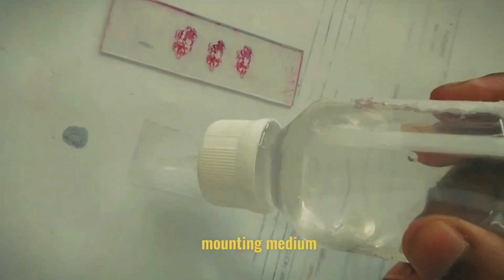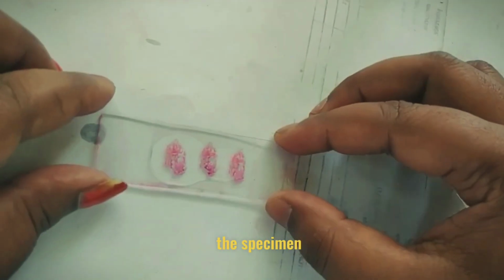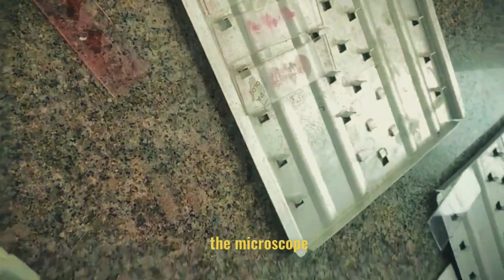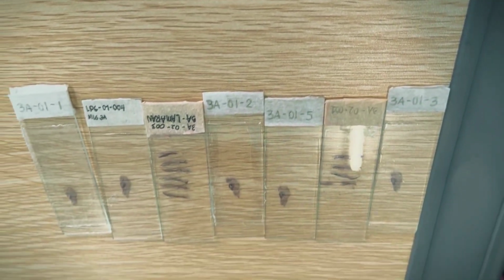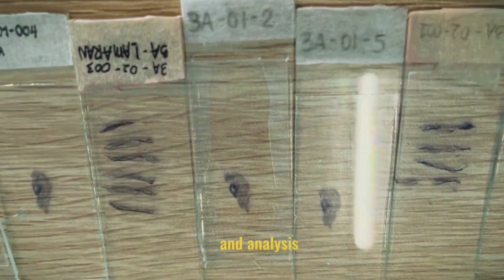After the staining procedure, we will apply a mounting medium to each tissue section, then carefully place a cover slip over the slide to protect the specimen and preserve its integrity for subsequent analysis under the microscope. The preparation is complete. The slides are now ready for microscopic examination and analysis.